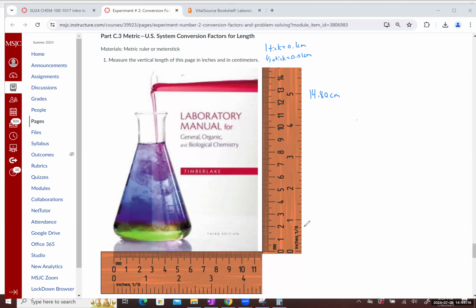So in this case, to go from 0 to 1 inch, in 1 inch, there are 1, 2, 3, 4, 5, 6, 7, 8 tick marks. So 1 tick corresponds to 1/8 of an inch. This is a little problematic, but let's write this out in number form, because writing it out as a fraction is a little bit cumbersome, to say the least.